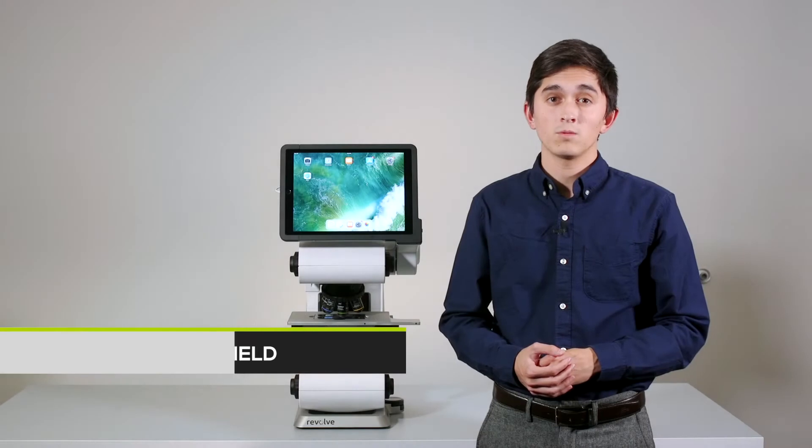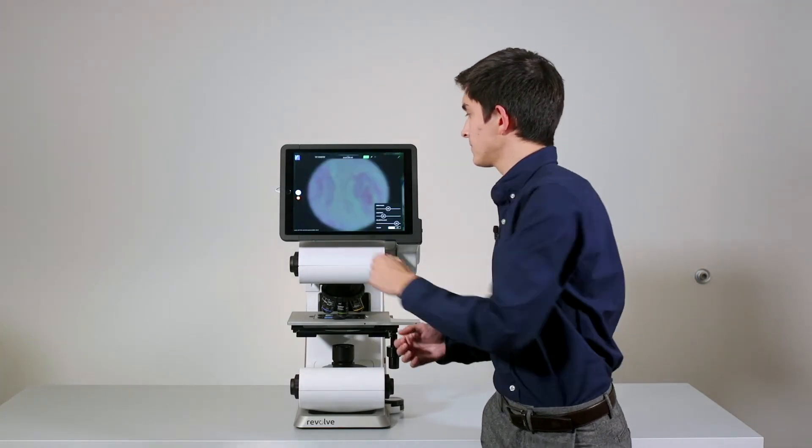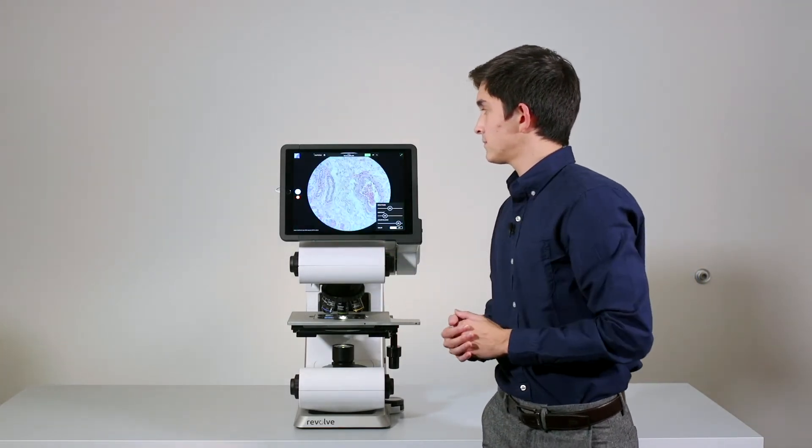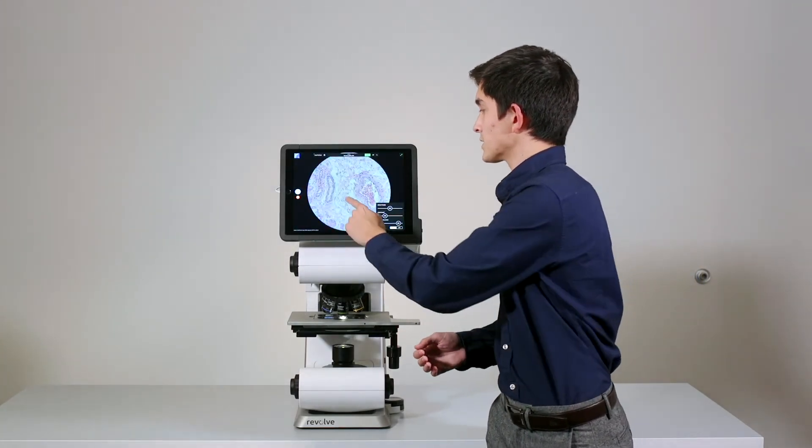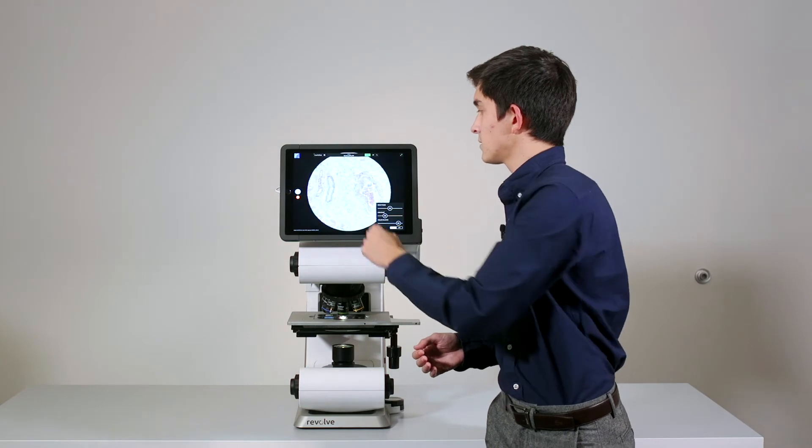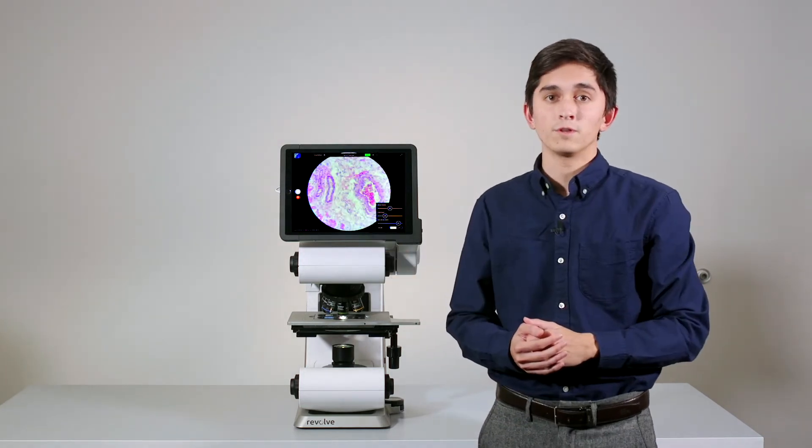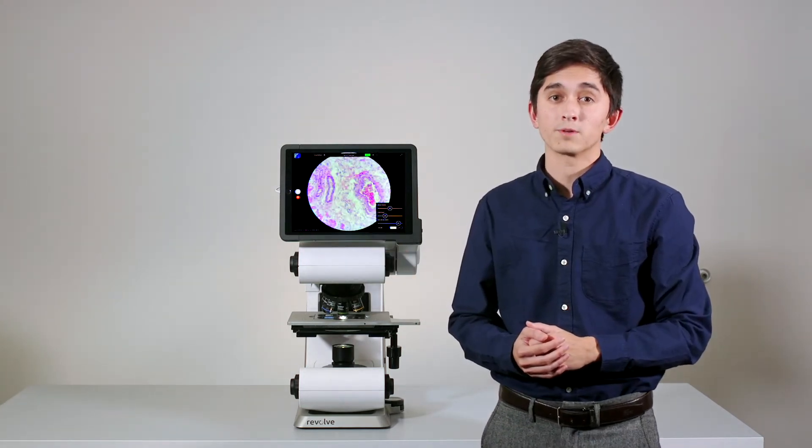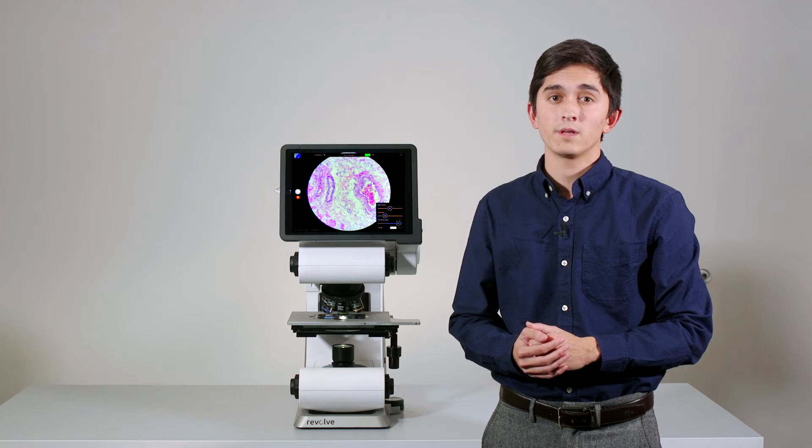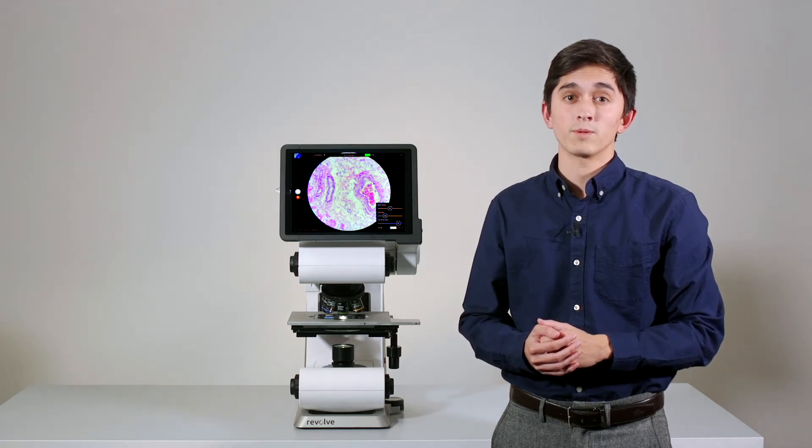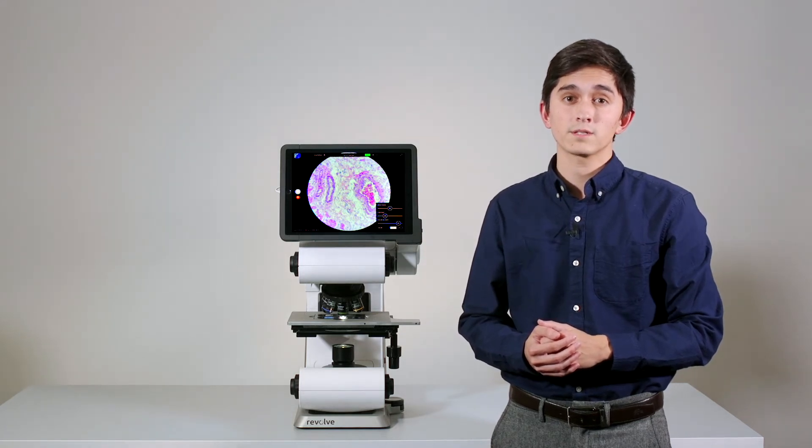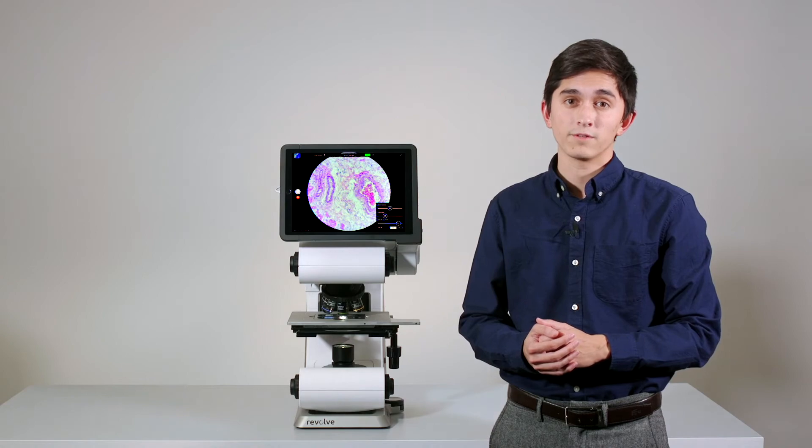To begin, we'll open up our app. We'll tap to auto-expose, and you'll see a full field of view captured by a 12 megapixel color camera. In this mode, you can also perform phase contrast, polarized light, and dark field.